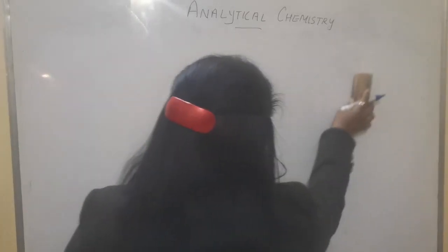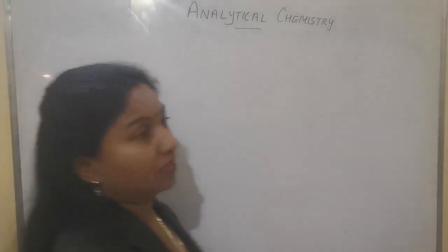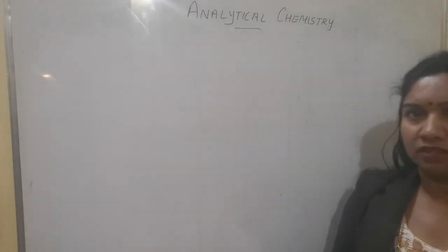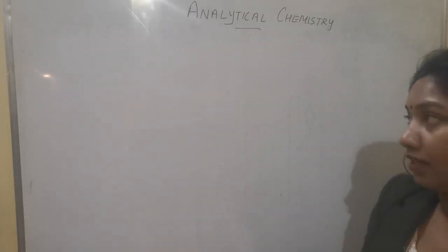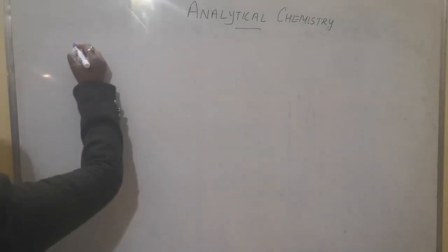We know about certain colored and colorless metal ions. Only a few metal ions are colored, and most of the rest are colorless, whether it is a cation or anion. So we have seen colorless and colored ions. Now we will see the action of NH4OH.